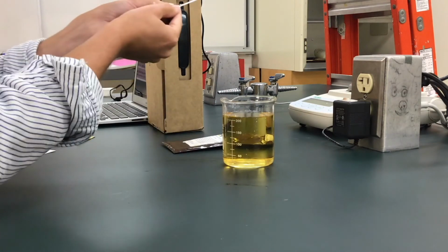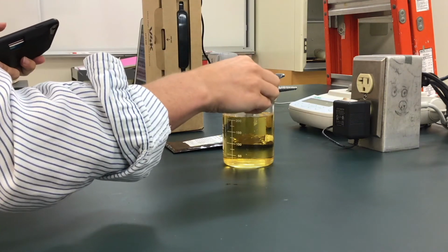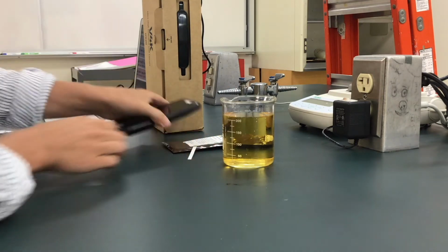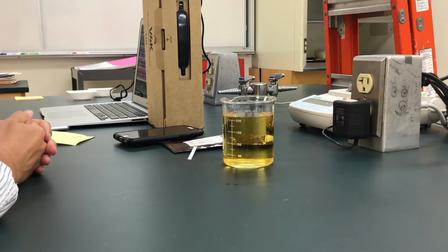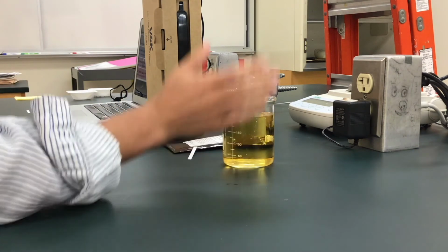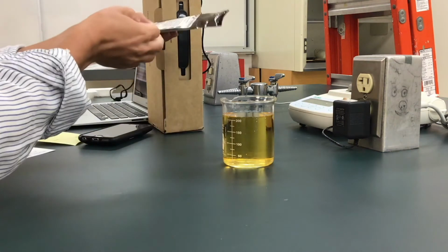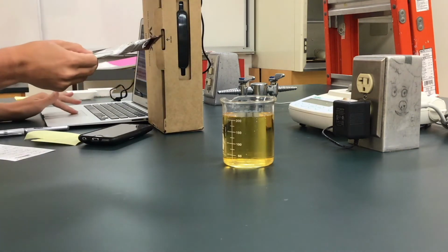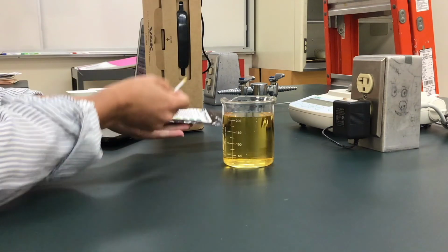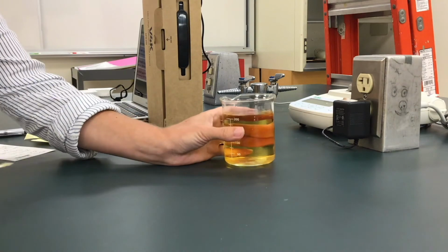So just like we did last time, I'm going to take the test strip, set it in, and start a timer. And leave it and allow it to give us an indicator of how much glucose there is in our distilled water and Lugol solution. Okay, and we'll look at it, and it's hard to see under here. Turn the brightness down. We don't really see any. It's pretty yellow, and so it's low on the glucose volume, which is unsurprising.